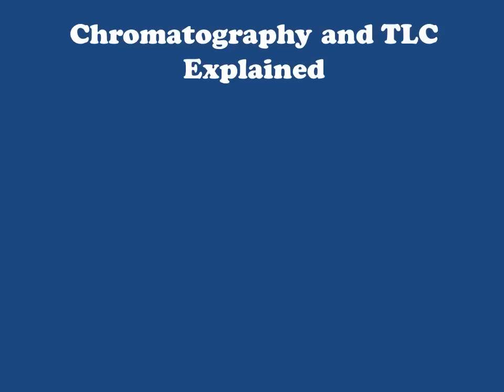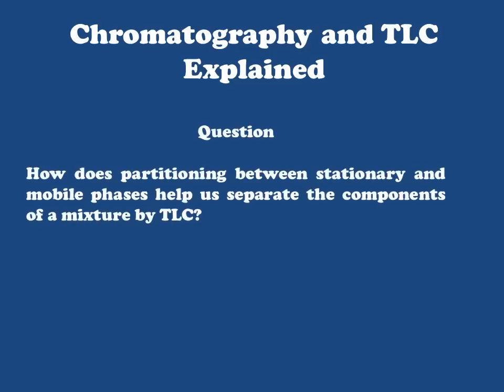Welcome to a brief explanation of the principles governing normal phase chromatography, and on a little bit more practical note, how we can use thin layer chromatography to identify and separate compounds from mixtures. Let's begin our discussion with a question. How does partitioning between the stationary and mobile phases help us to separate compounds from a mixture by thin layer chromatography?